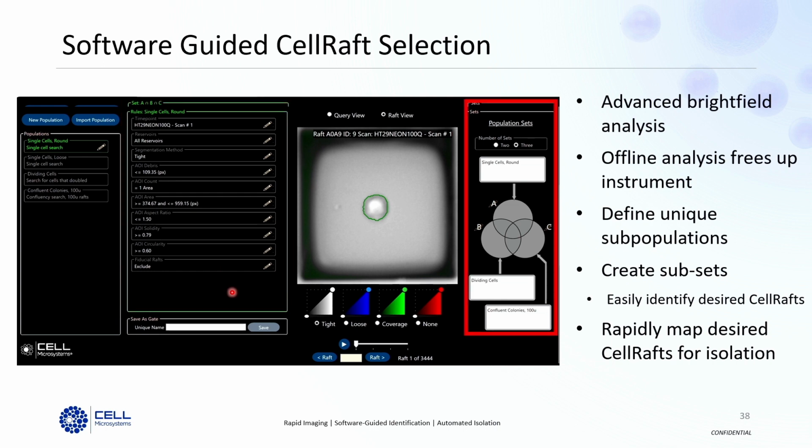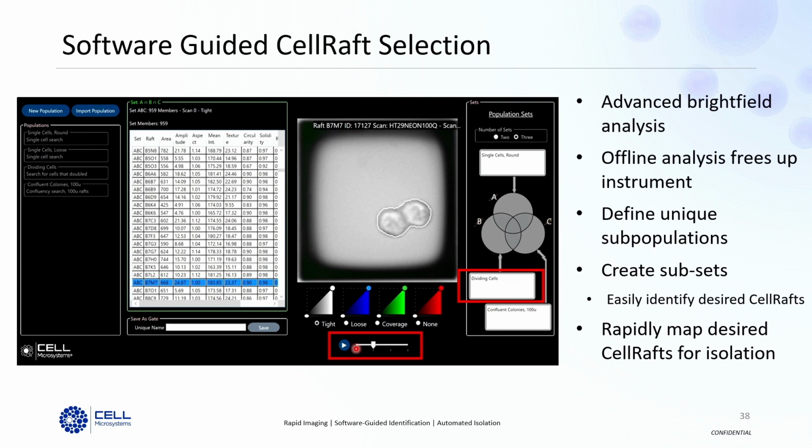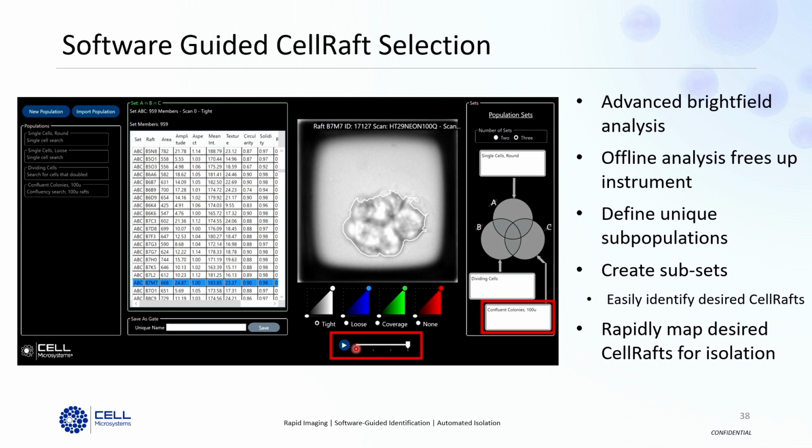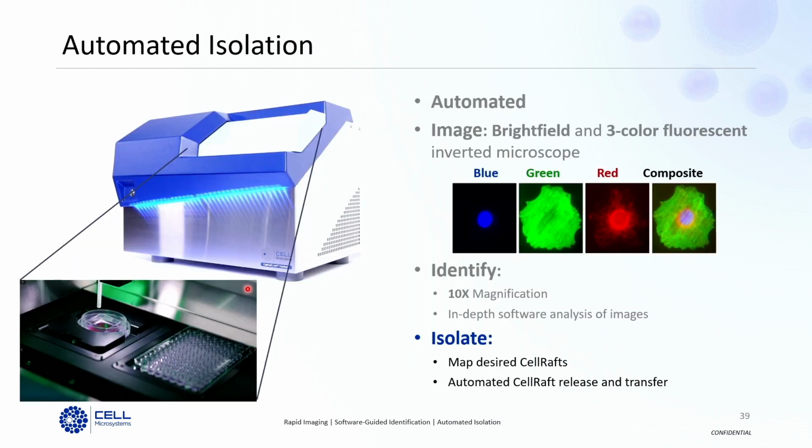The population set feature allows you to overlay multiple populations that you've made. So, for example, if you're doing a clonal cell line development workflow, you might be looking for single cells at scan 1, cells that have doubled at scan 2, and then at your last time point or somewhere further in the experiment, a colony of cells at that later time point. But importantly, you can overlay these populations, select the intersect of all three of these, and now you have a generated list of all of the cell rafts that were a single cell at time 1, doubled by time 2, and had a small colony at time 4. So after you've identified your cell rafts of interest, you can very rapidly map them for automated isolation using the air system.